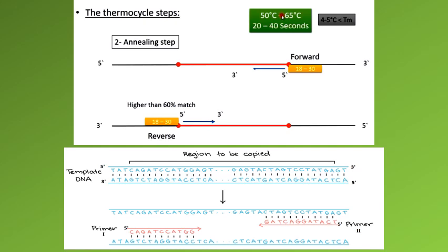Therefore, both primers act in opposite direction. This is a very important point.